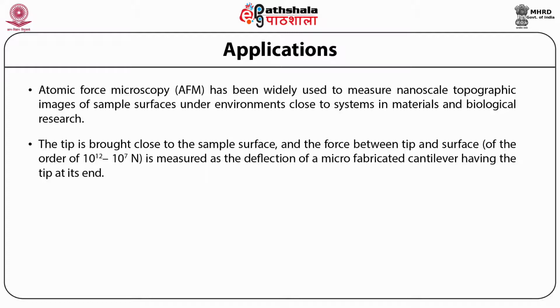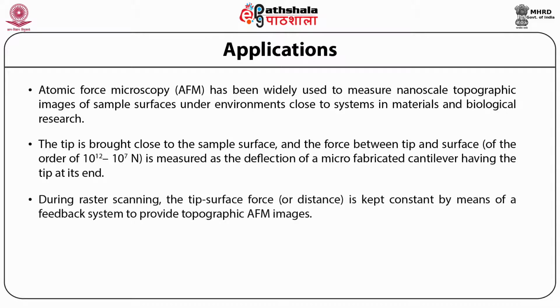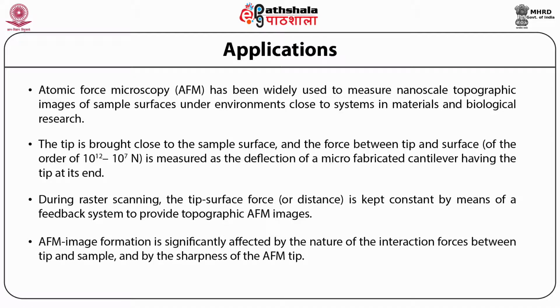The tip is raster scanned over the surface using a piezoelectric device that can control the tip position with sub-nanometer precision. During raster scanning, the tip-surface force is kept constant by means of a feedback system to provide the topographic AFM image. AFM image formation is significantly affected by the nature of the interaction force between tip and sample and by the sharpness of the AFM tip.